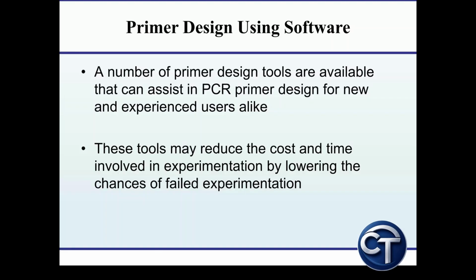Now let us discuss the tools used. Modern bioinformatic tools allow automated primer design, for example, Primer3, NCBI Primer-BLAST, and OligoCalc. These tools apply all design parameters and generate multiple primer options. Furthermore, they also provide detailed analysis. They make the process faster and more reliable.